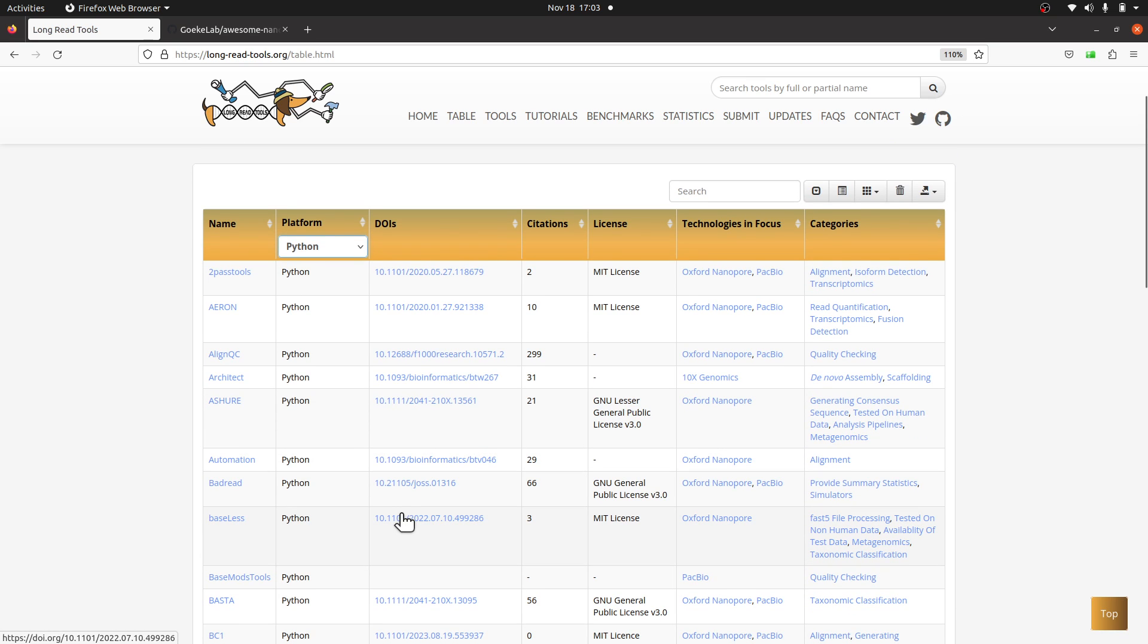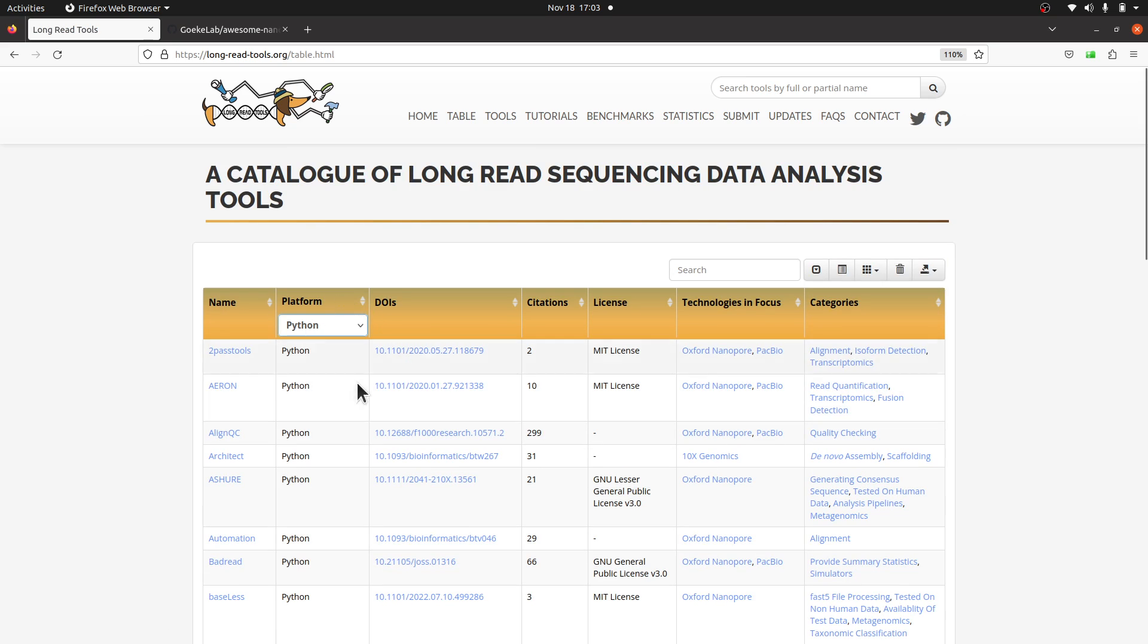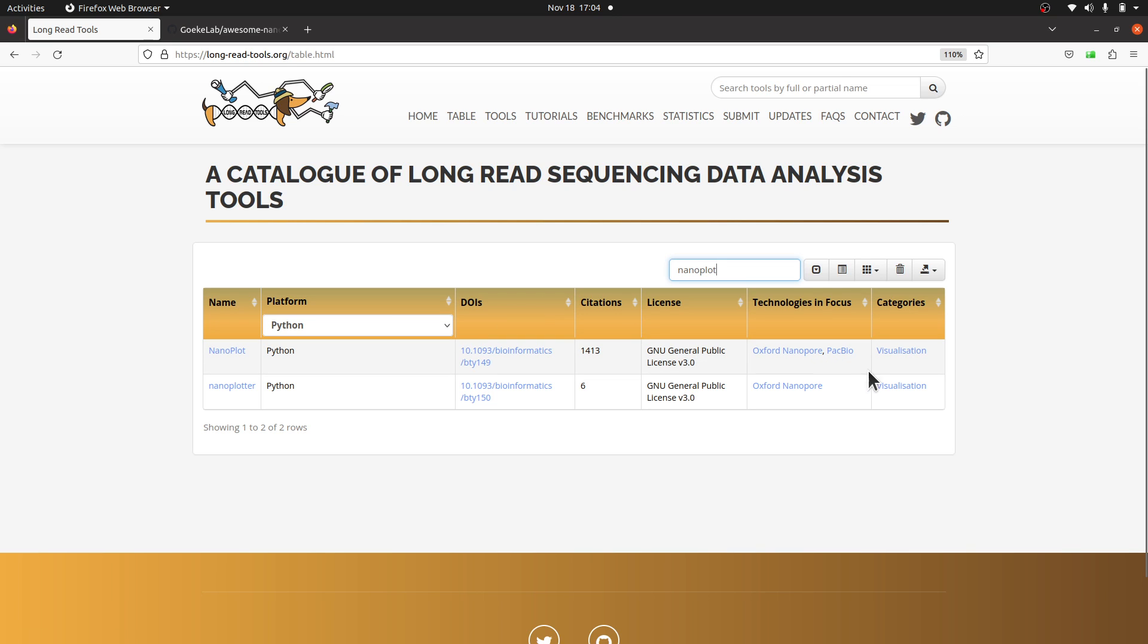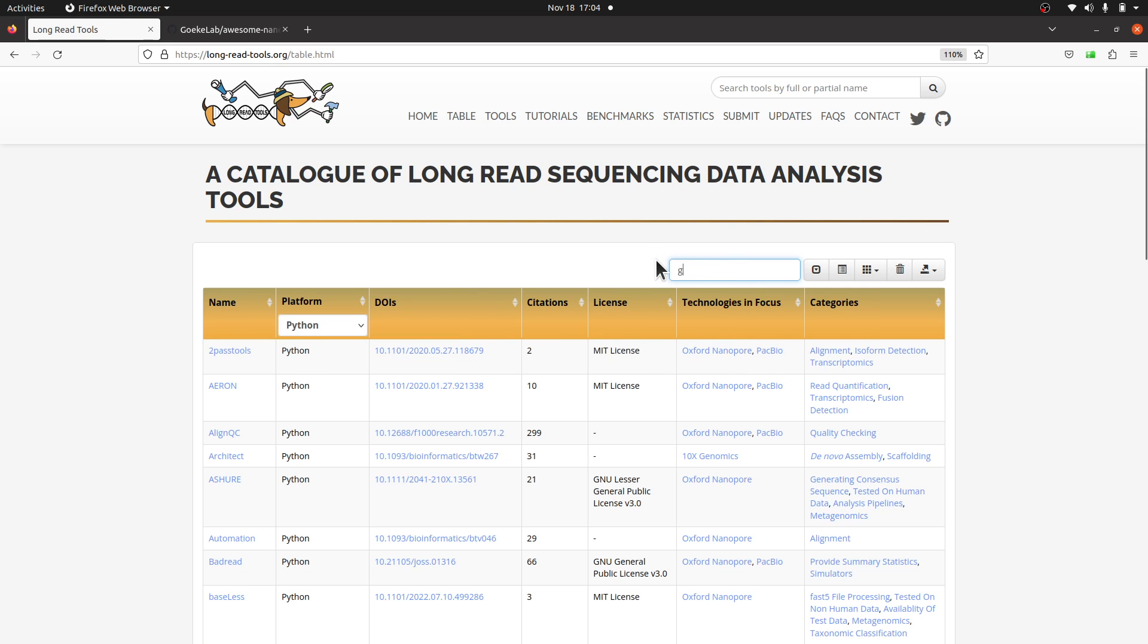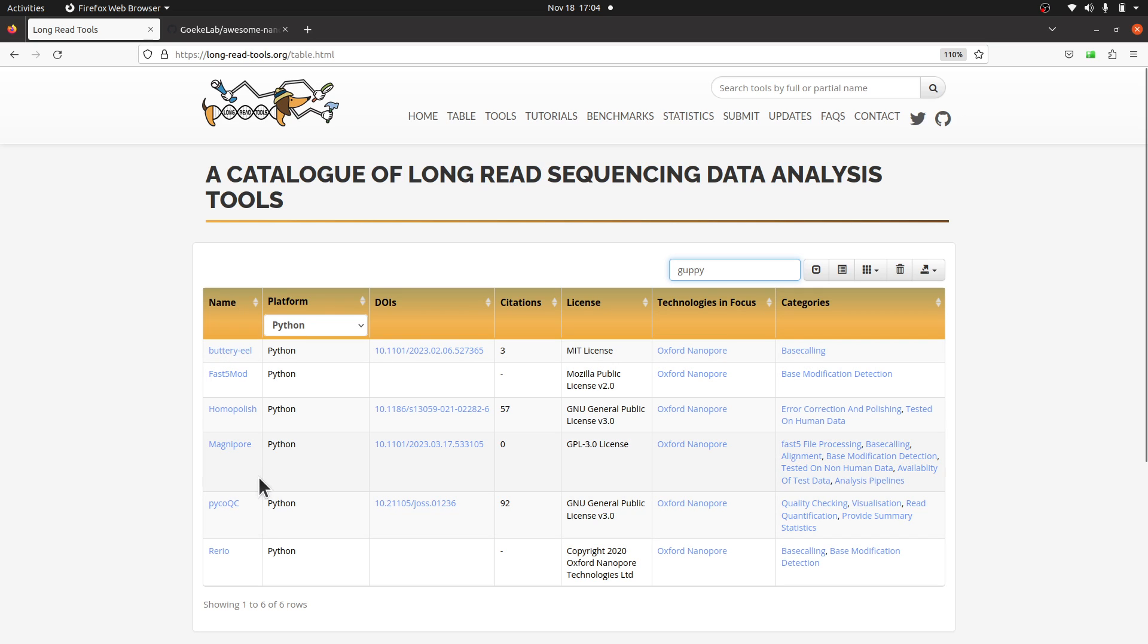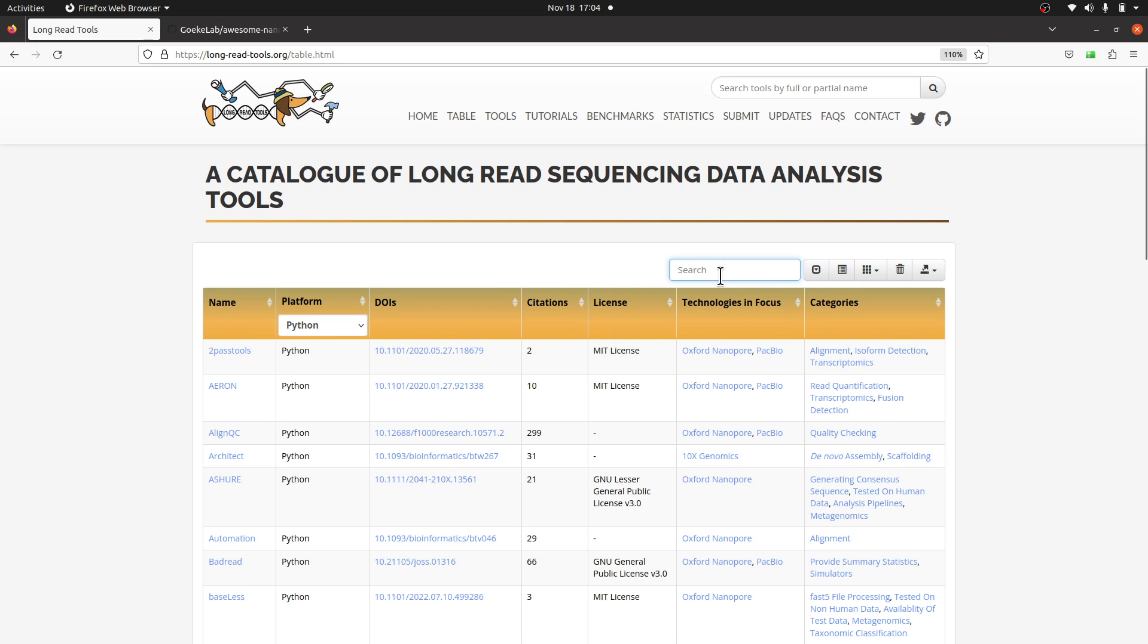It's not only about this—you can also search. So let's just say I want to search for, let's say, nanoplot. When I click it, it gives me tools that contain nanoplot. Of course, we have nanoplot here. Platform is Python, visualization. Nanoplot is used for QC—it visualizes quality and some information about your long-read data. You also have nanoplotter for visualization. You can also search, let's say guppy. Let's see what comes up. I don't see any tool yet, so that means that is not available.